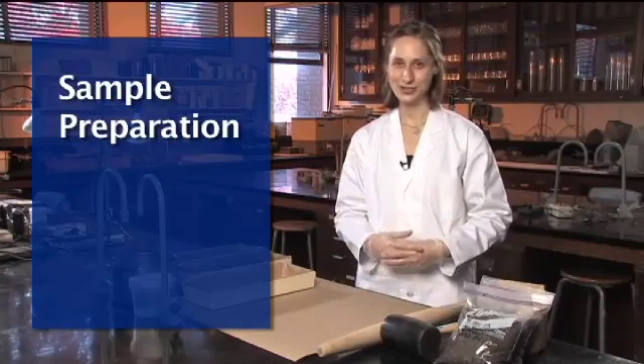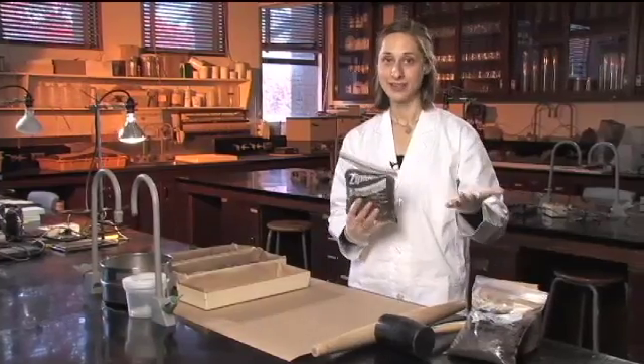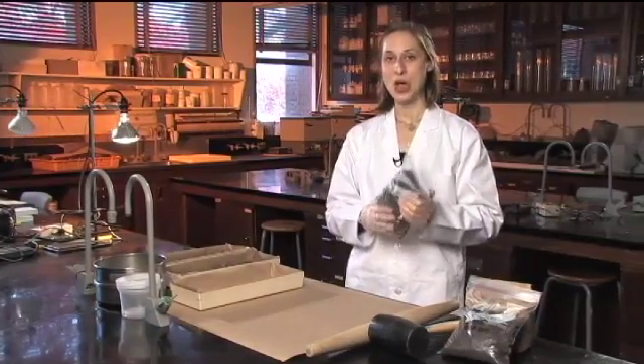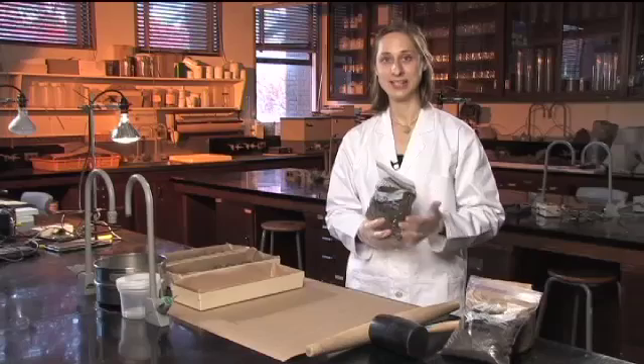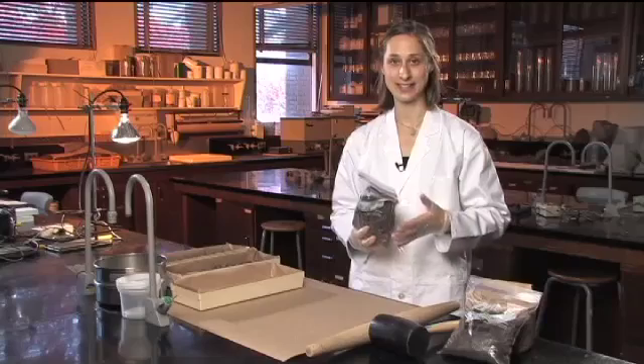So you've been to the field, you've collected your representative soil sample and brought them back to the lab. Now what do you do with it? A common preparation for many sample analyses is air drying and then sieving, crushing or grinding the sample.